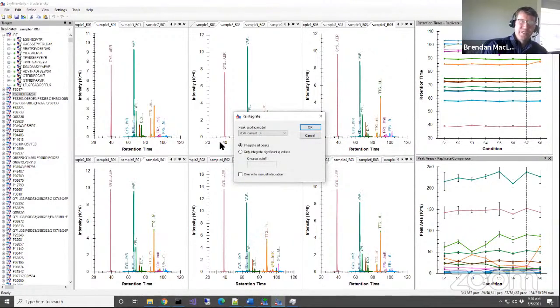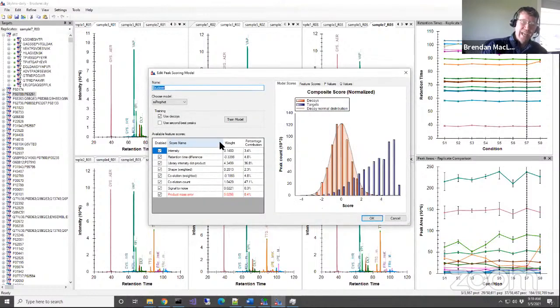So despite that you can zip right through and actually have MSstats results, you can come back in here and really assess your data and say, was this good? Did this work out okay? So here you can see that we chose to use decoys. The decoys are down, if you see the status bar is still showing down at the lower right here, I'm circling it with my mouse. You can see that in this document, I have 350,000 transitions. Those are the decoy transitions.